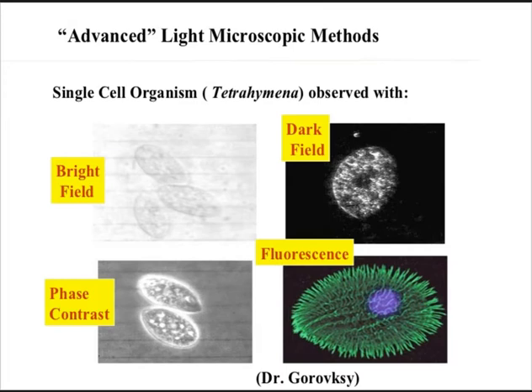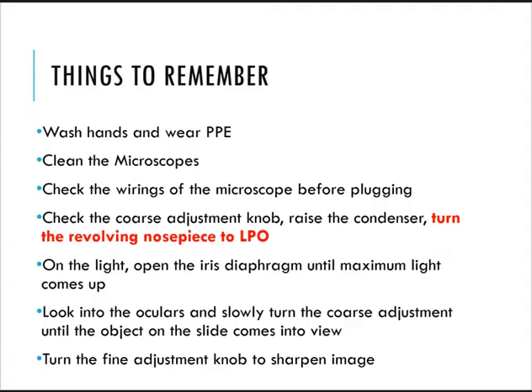Now I hope that is clear for your four types of microscopes. Again, we have your bright field, your phase contrast, your dark field, mainly used for identification of T. pallidum, and then your fluorescence microscope, for your cells. And then the next part is your things to remember.